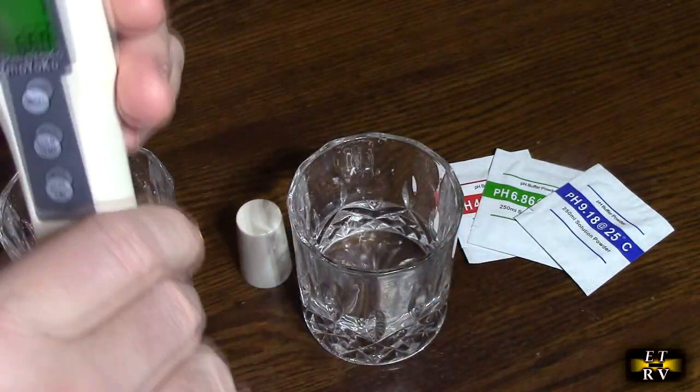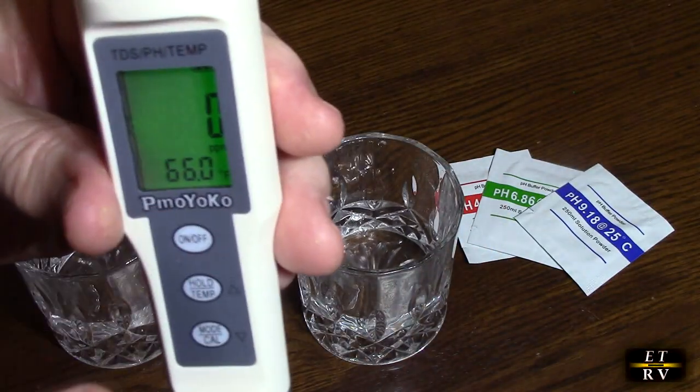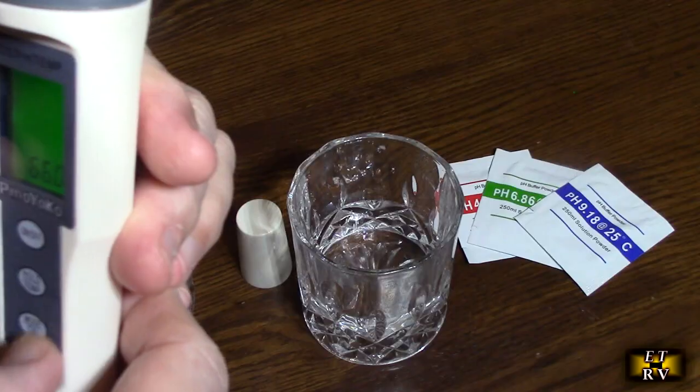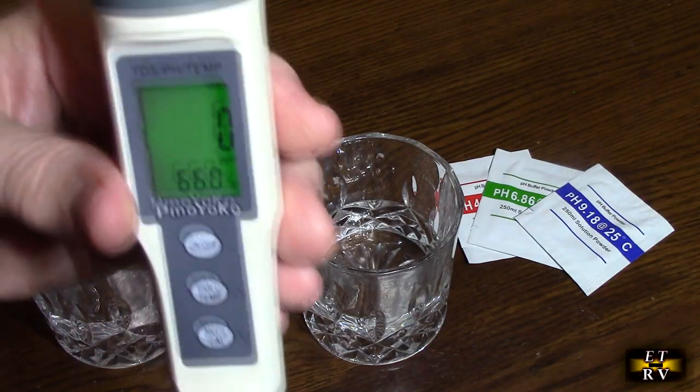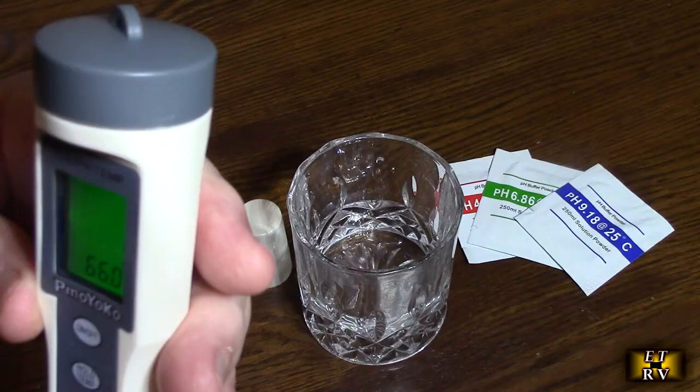It's really nice because not only that, but it tells me the temperature is 66 degrees. And there's a calibration mode on there and the manual talks about using those powders if you want to fully calibrate it.